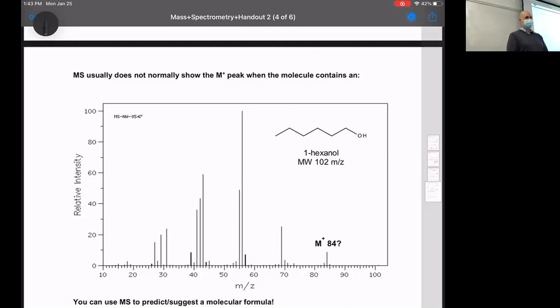which seems terrible, except when you remember that you almost always do IR and mass spec hand in hand. So do you remember, Olivia, what the peak looks like in an IR for an alcohol? Just a parabola. It's a pretty smooth and obvious parabola around like 3,300.